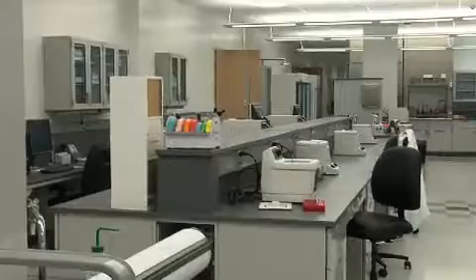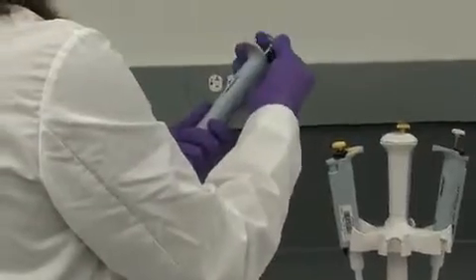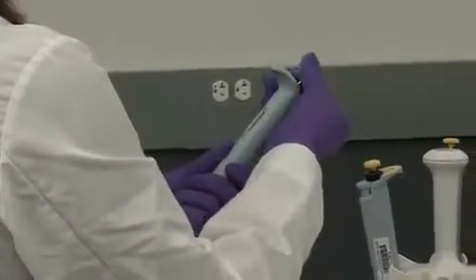So basically this is a forensic biology unit. Forensic biology is composed of two different sections, serology and DNA. Serology basically is where we identify what the body fluid is, whether it's blood, seminal fluid, or hairs from a crime scene. Once we characterize what it is, whether it's blood or seminal fluid, it then goes on to DNA analysis.